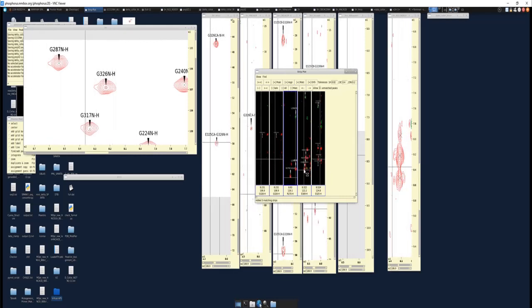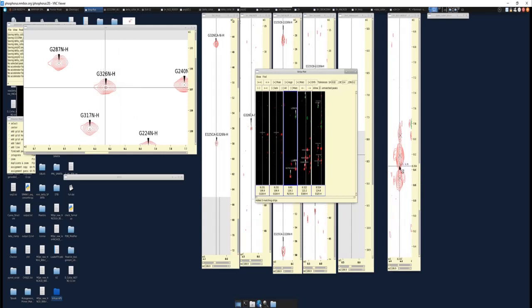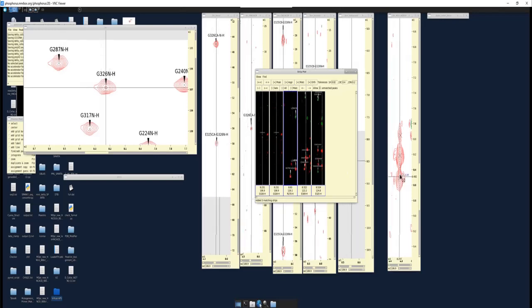So let's look at this other match. This is at around 8.34. We can see again, and keep in mind where you'll see the horizontal bar in the NOESY when I line these up. You can see in this scenario, that doesn't line up perfectly either. If we look at the third match here, and we line it up, we can see it's at 8.53. That is a much better match to this horizontal, to this peak that's right here.